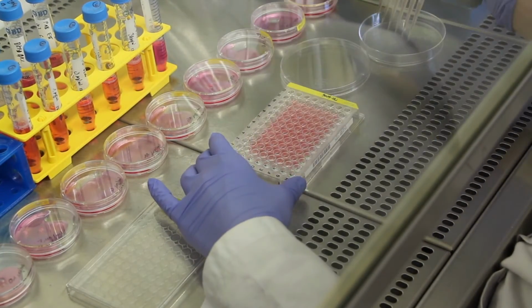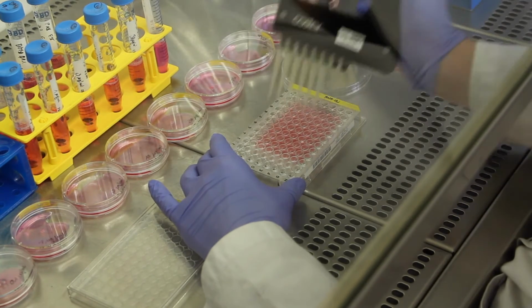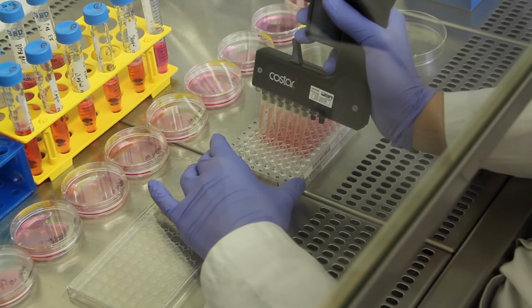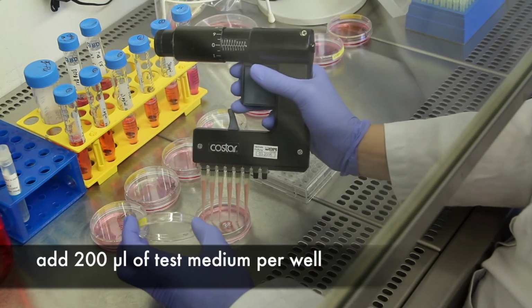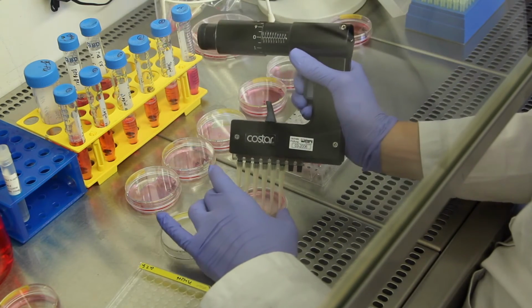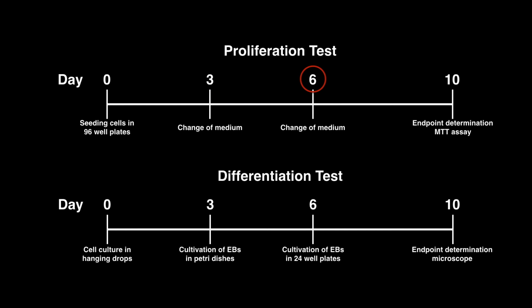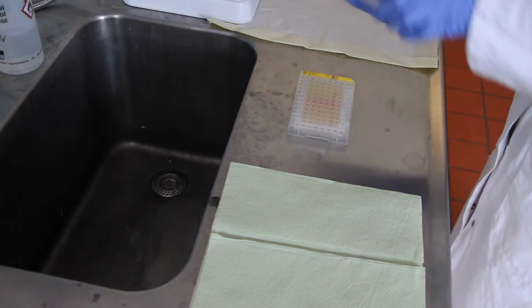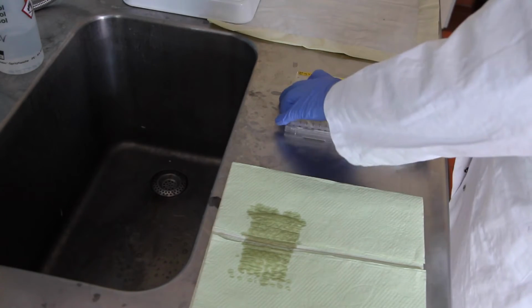After 72 hours, a medium change is performed. The exhausted medium is vacuumed off and replaced with an equal amount of fresh medium. After another 72 hours in the incubator, this step is repeated. On day 10, the plates are freed of the test suspension by inversion. Since the further timings are short, sterile work is no longer necessary from this time on.